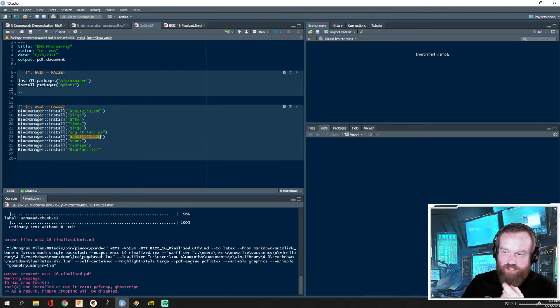These 2 ATH ones are kind of database files for Arabidopsis, and that's the plant we're going to use for this gene expression study. And in here they have descriptions of what the gene is, the gene symbol, the TAIR number, which is the Arabidopsis Information Resource. It also has another identification number. I don't remember if it's Entrez or whatnot. So each database always has their own numbers, so we have to match them up, right? And the same thing here with this org.At.tair database. This gives us more information on the genes that we're going to identify.